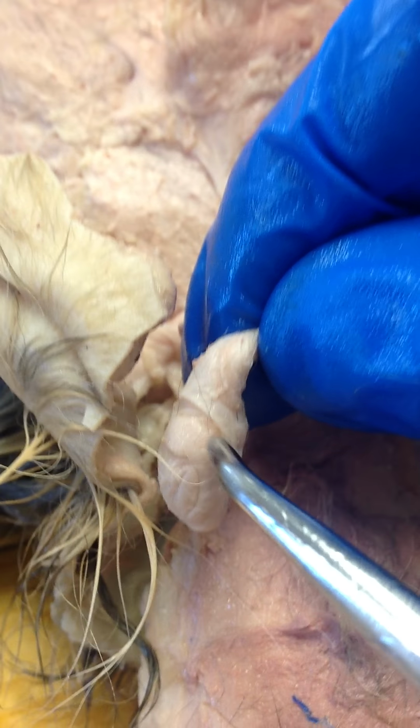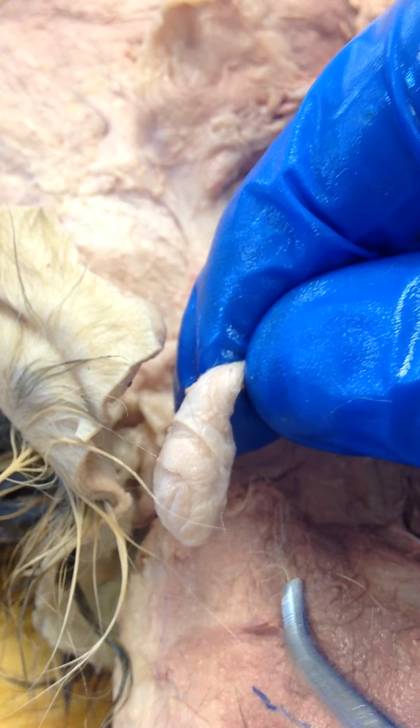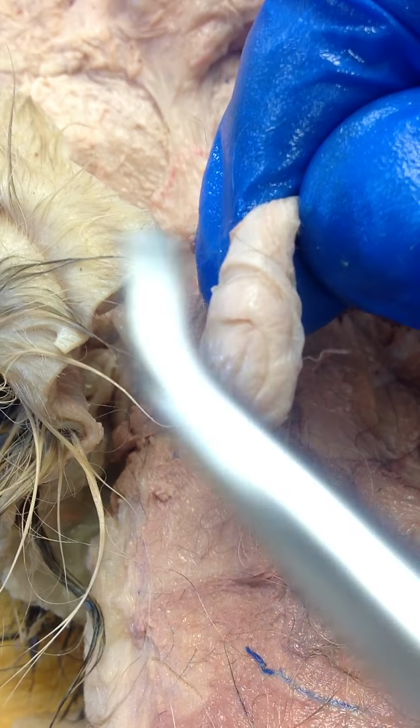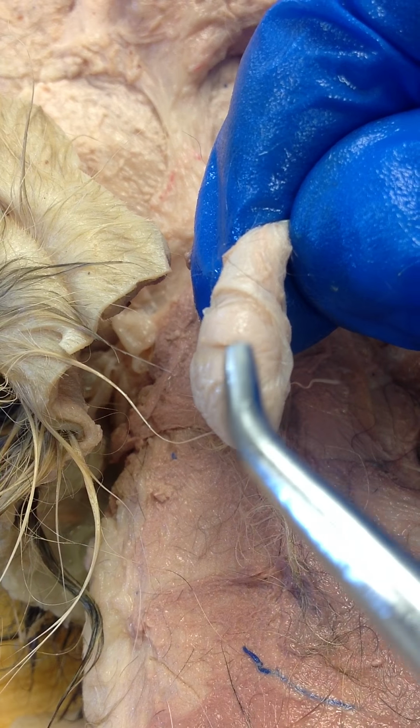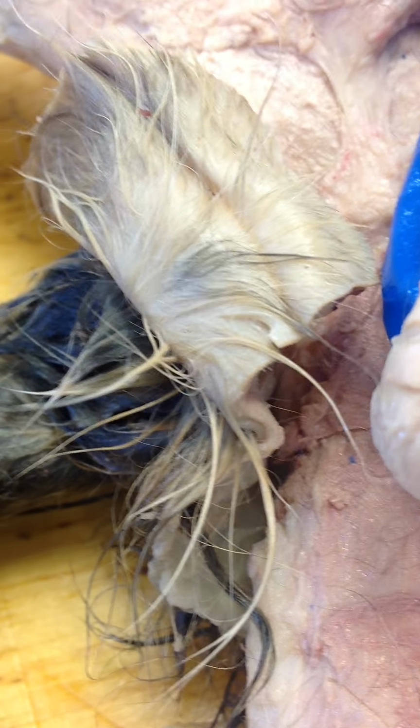It lays on top of it all along, kind of like when the pancreas is laying on top of the duodenum. But yeah, you can see the line here. It curves like that. That's the edge of the epididymis, the bottom edge.